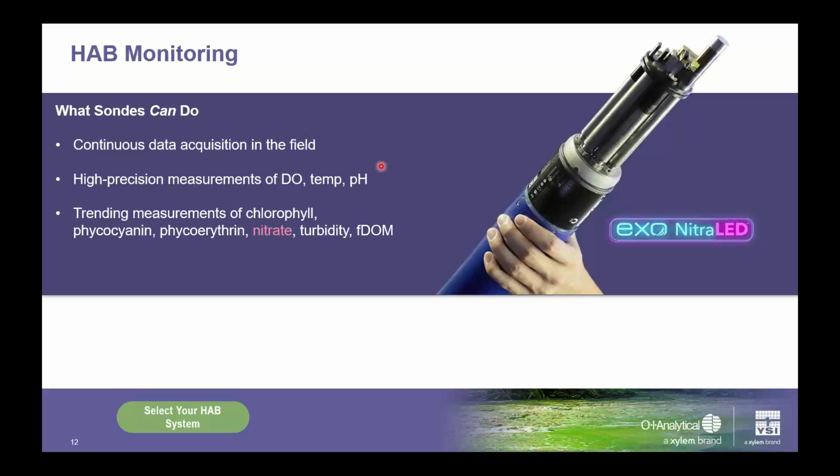All of these are responding or driving harmful algal blooms, as we just mentioned. Now, when it comes to chlorophyll and phycocyanin, which are the primary pigments in blue-green algae, you can measure those with a sonde. It is what I would call a trending measurement, not really an absolute measurement.